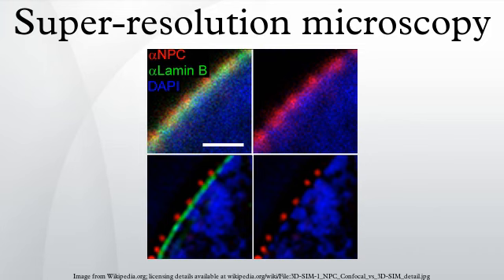The fluorophore is subsequently deactivated, and another subset is activated and imaged. Iteration of this process allows numerous fluorophores to be localized and a super-resolution image to be constructed from the image data. These three methods were published independently during a short period of time and their principle is identical. STORM was originally described using Cy5 and Cy3 dyes attached to nucleic acids or proteins, while PALM and FPALM were described using photoswitchable fluorescent proteins.